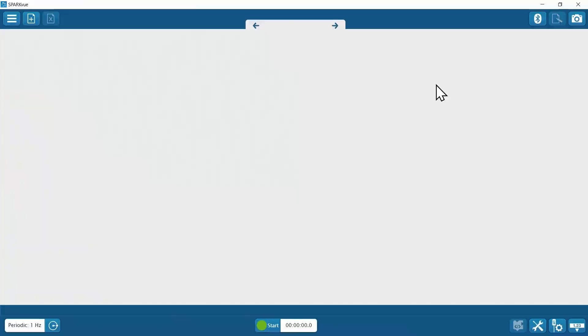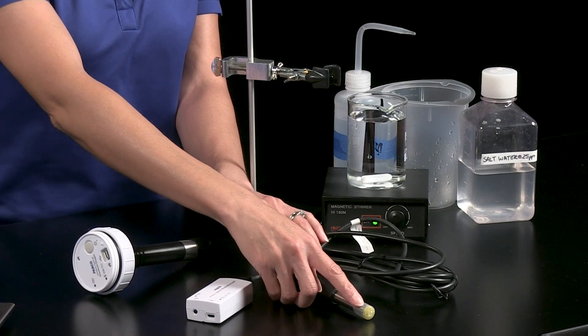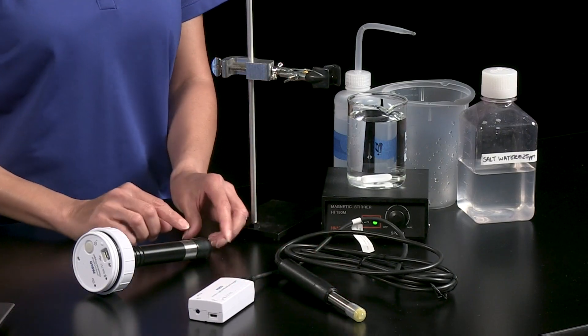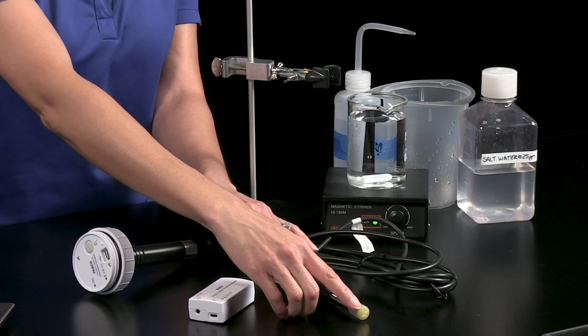I'll choose the monitoring dissolved oxygen quick start experiment to display a couple of water quality parameters. First, I have to remove the rubber boot. The boot keeps the probe cap membrane from drying out while also protecting it from accidental contact and scratches, and the sponge inside the boot keeps the probe sensing layer at optimal humidity when it's not being used.